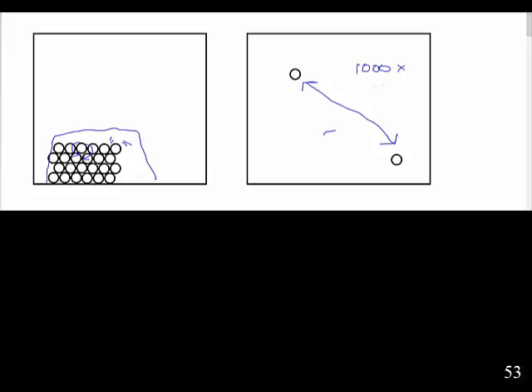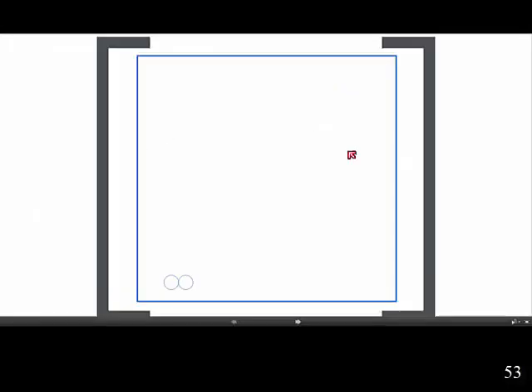I don't know what you're going to look up. If you look it up, you'll see some information about just how different the volume is. For this here, I don't think I'm really giving you a 1,000 difference. If I was going to take this by 1,000, it would look a little bit like this. So what I've got here is a solid, and I've just done 2.